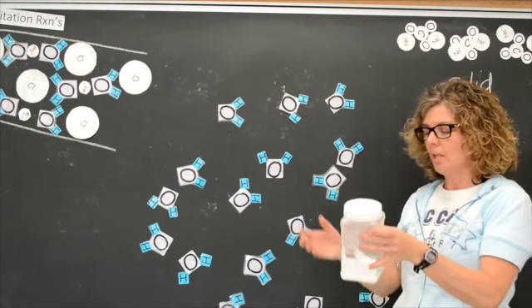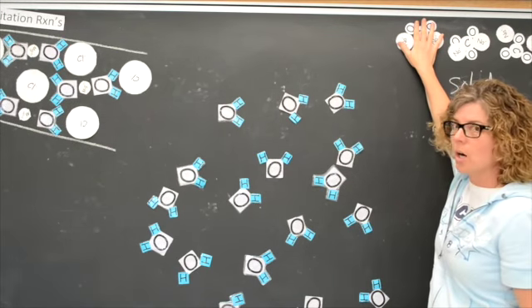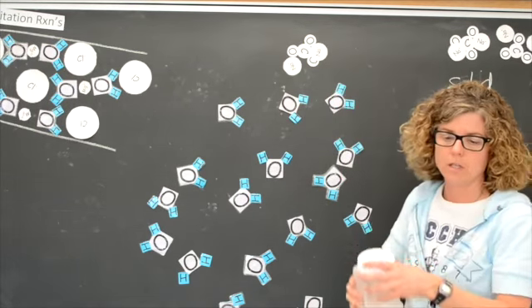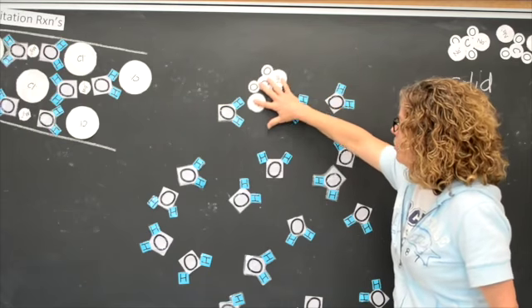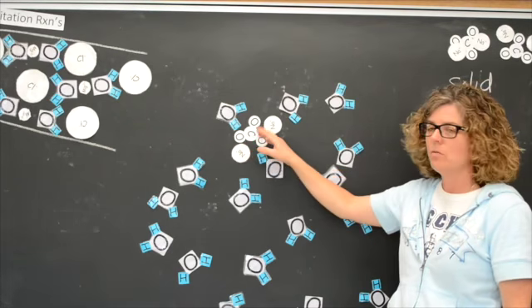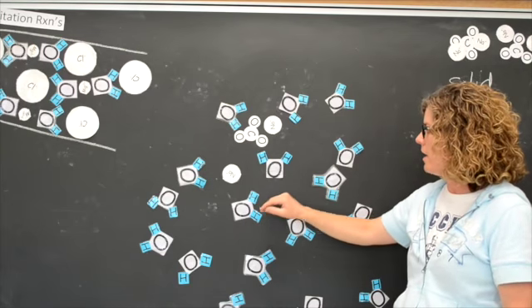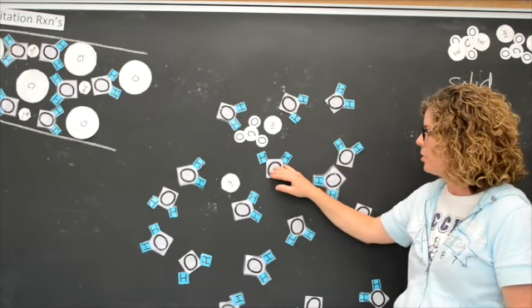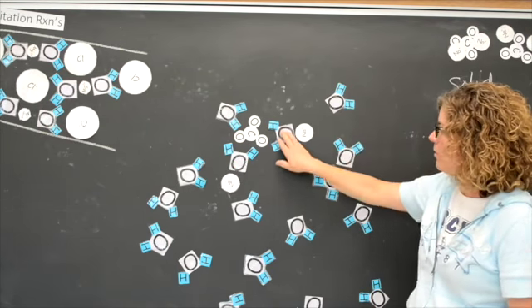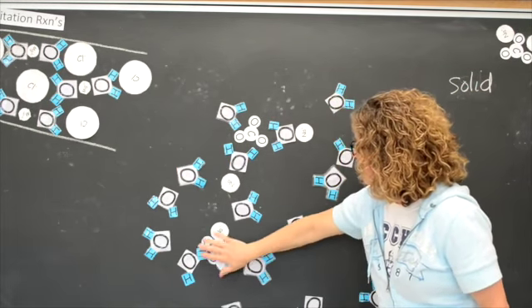What I'm first going to do is show you dissolving. It's always good for us to see it again. I'm going to take my sodium carbonate and put my powder into my water, and I am going to show you dissolving. This does dissolve, so we know that the attraction between the carbonate and the sodium is not as strong as the attraction between the water and the ions. Water is going to be able to get in between that sodium carbonate and dissolve it. So there we have an example of dissolving. Let's take some more powder and dissolve that in here.